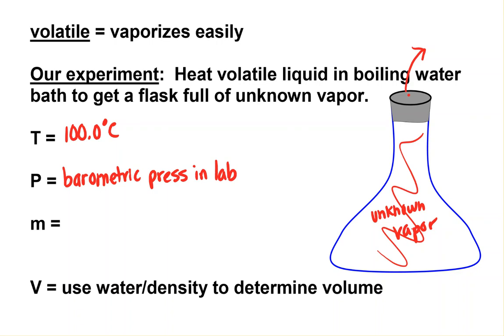Just like if you got on a scale in a swimming pool, since the density of your body is similar to the density of the water around you, you wouldn't get a true mass for yourself.